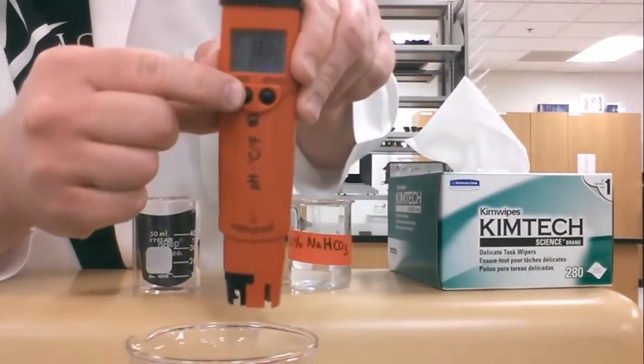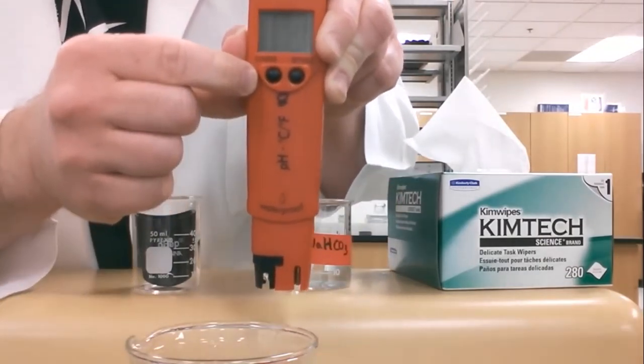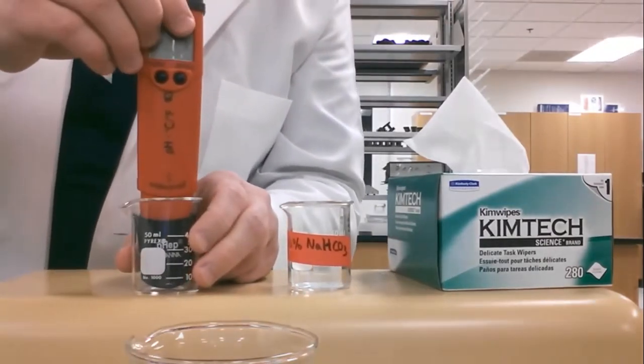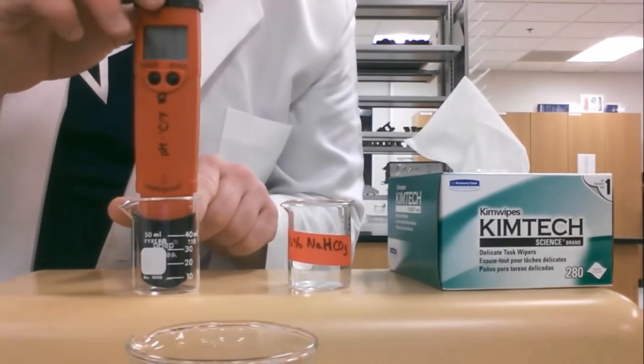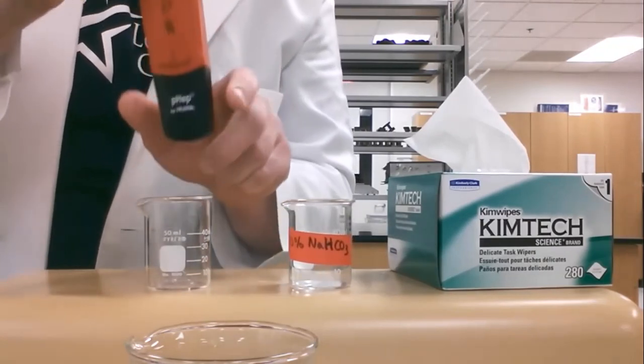So we're going to hold the power button for 1 full second again till it says off. There we go. So once it's turned off, you can now put the cap back on. You can do this by leaving the cap inside the beaker that you had it in and pushing down to snap it on, or you can do it with your hand.